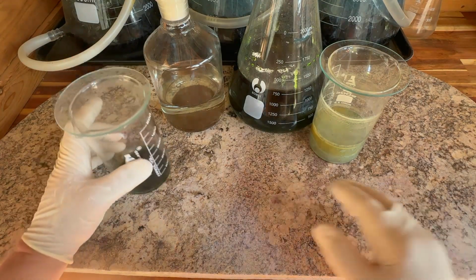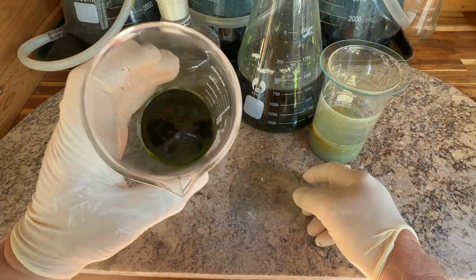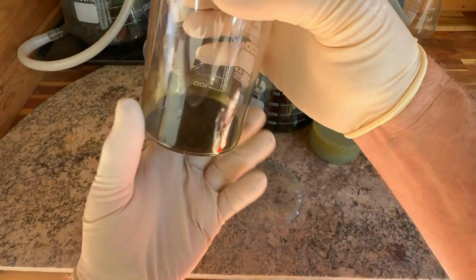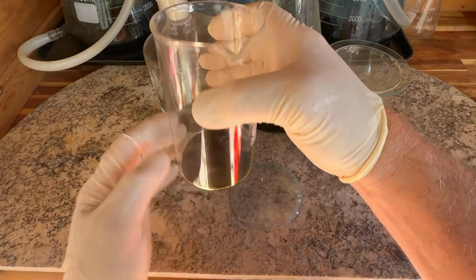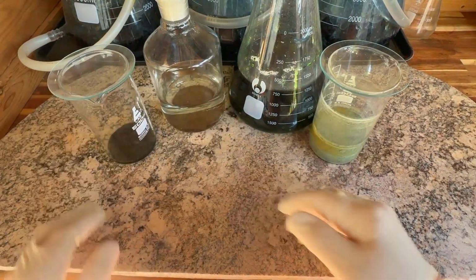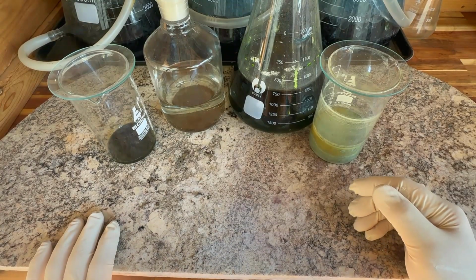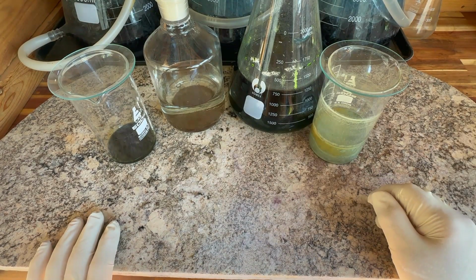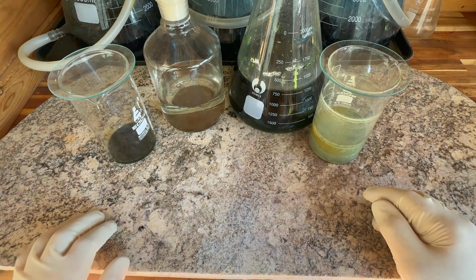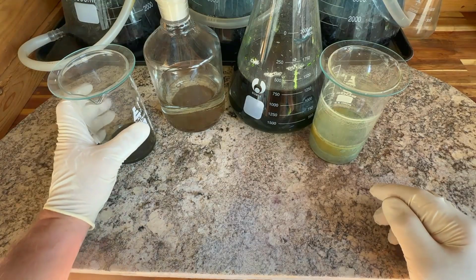So as we get started here, this first beaker has some precipitate. This came from a gold-filled refining. One of the things I found with gold-filled is they're always very dirty drops when you initially do them. And even though the test's not there, generally, if I give it a day or two or three, a little more will precipitate out, which is very dirty and contaminated, but it contains a reasonable amount of gold. And so we're going to go ahead and clean that up and bring that out.